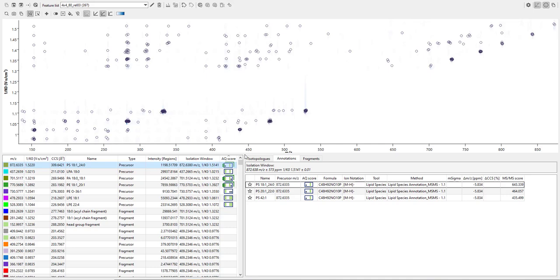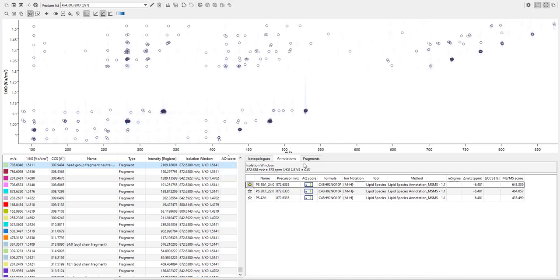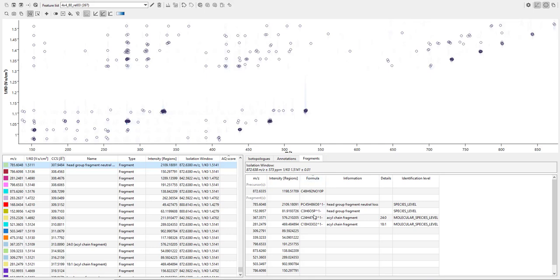For the lipid PS 42:1, we actually get 2 suggestions for the respective fatty acid combinations. In this case, for both annotations, the respective fragments were detected. Hence, we can assume that both lipids were present in the precursor window.